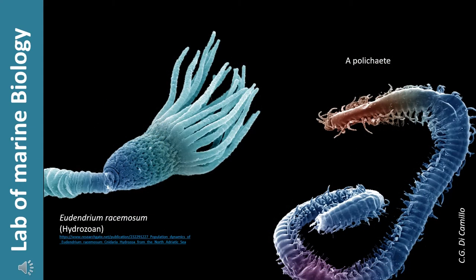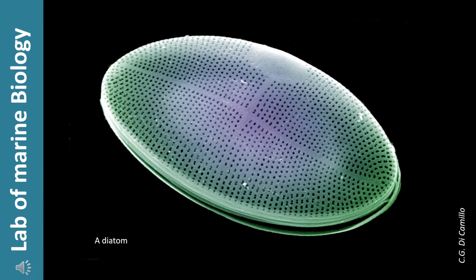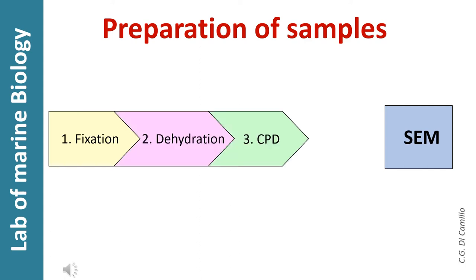The scanning electron microscope allows you to observe many more particulars with respect to light microscopy. Here, you can see the ultrastructure of a diatom. The steps to prepare samples for observation by scanning electron microscopy are: 1. Fixation, 2. Dehydration, 3. Critical point drying, 4. Sputtering.